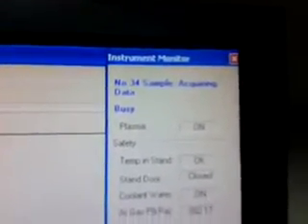It is self-measuring, acquiring data. It will stop in about one minute — it's remaining one minute to stop measuring. It is measuring now, acquiring data. When I am with you, my eyes are on the sample to make sure it doesn't go out of this pipe. I think it will finish now. Yes, look here — green button. Now it is ready; it requires the next sample, waiting, not acquiring data.